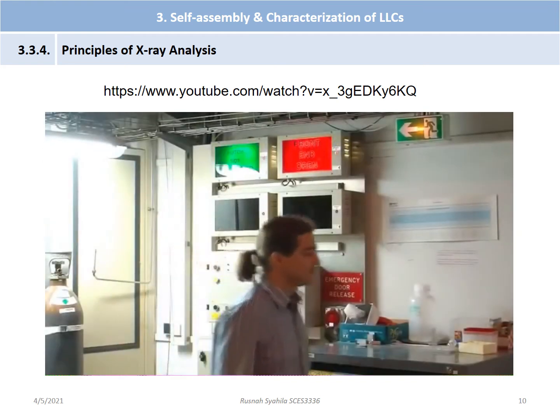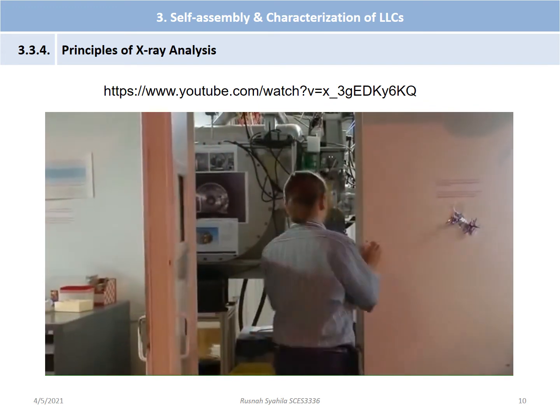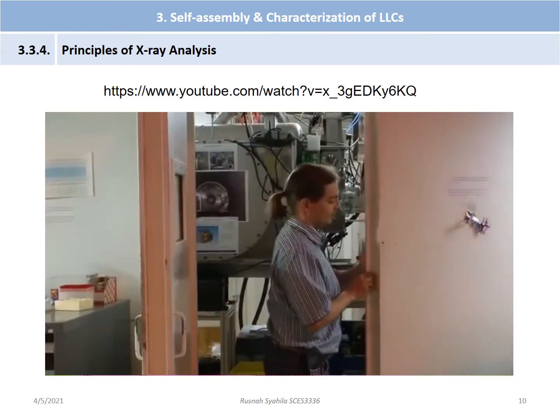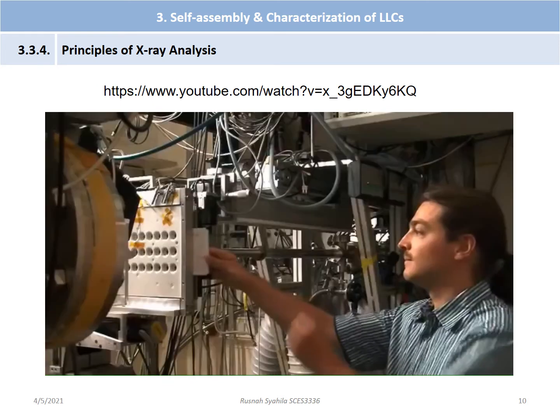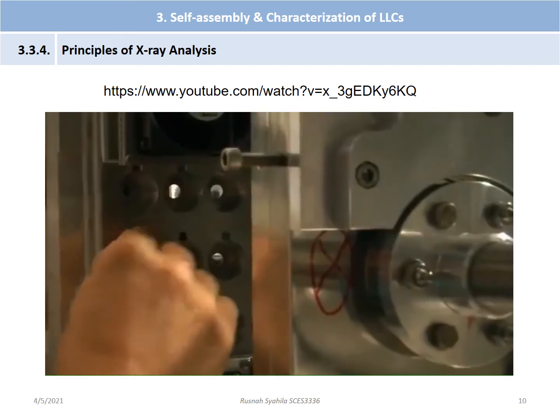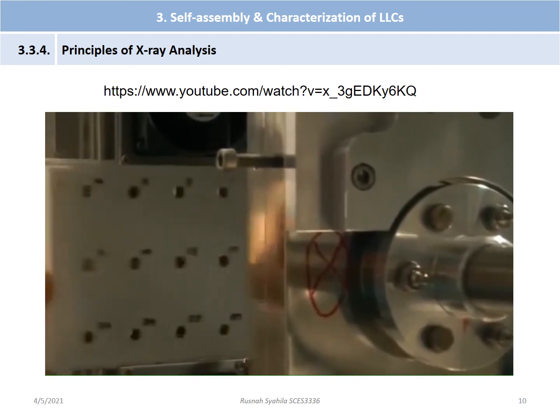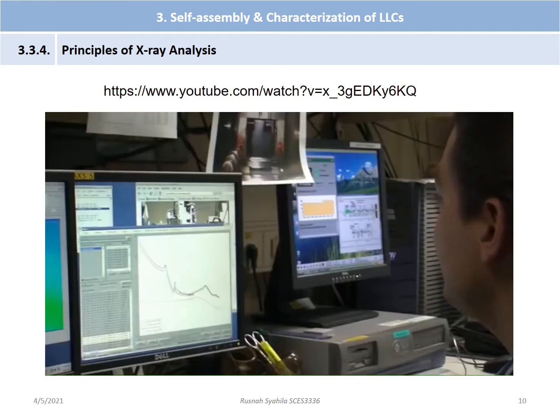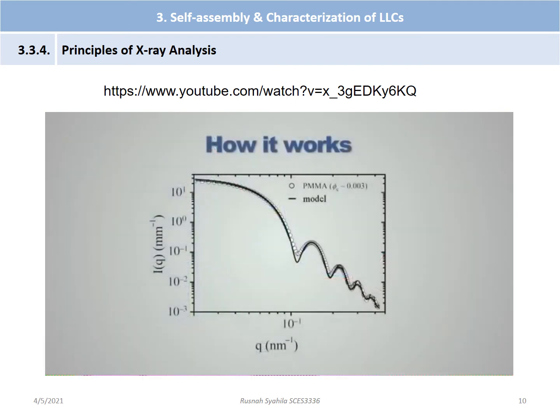As samples can serve, for example, polymer pieces of a few millimeter size, a drop of gel, or also solutions from 15 microliter. The scattered intensity recorded in the 2D detector is first azimuthally averaged, and the scattered intensity in absolute units as a function of the scattering angle can be afterwards fitted to structural models, which helps to distinguish between different morphologies, for example, spheres, micelles, or vesicles.